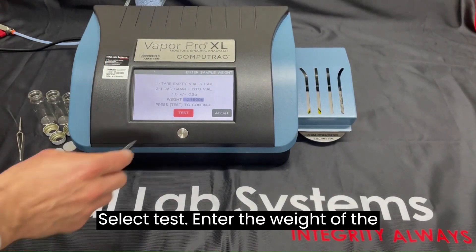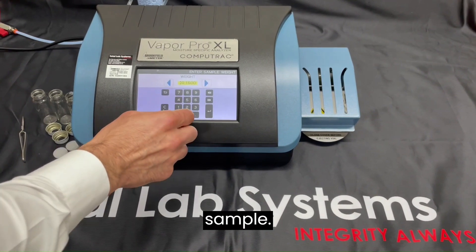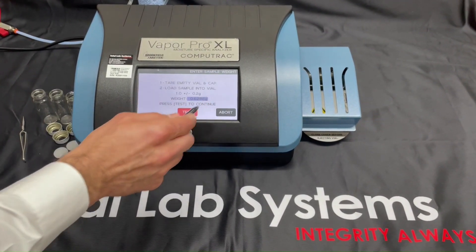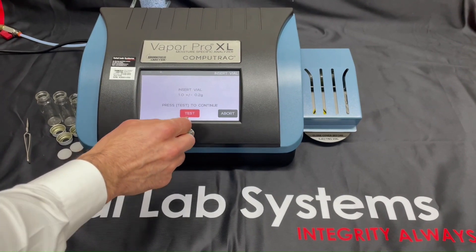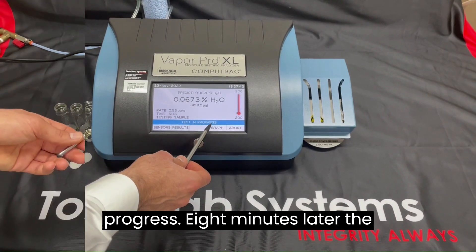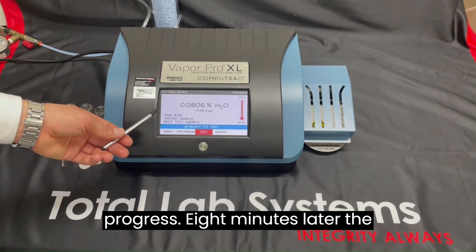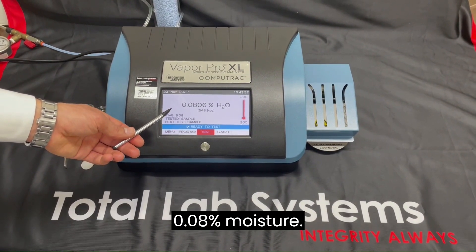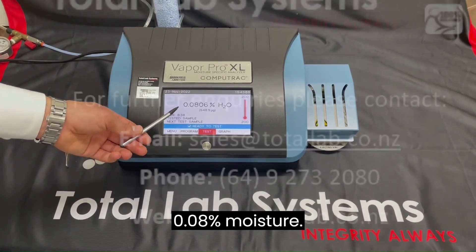Insert the vial, select test, enter the weight of the sample, and start the test. The screen shows the test in progress. Eight minutes later, the results are ready, and this sample has 0.08% moisture. Thank you.